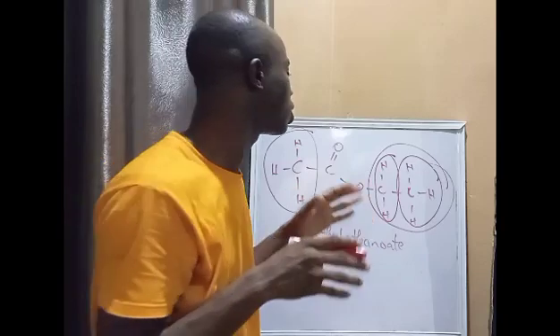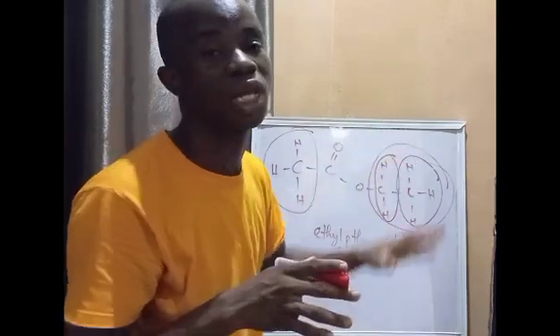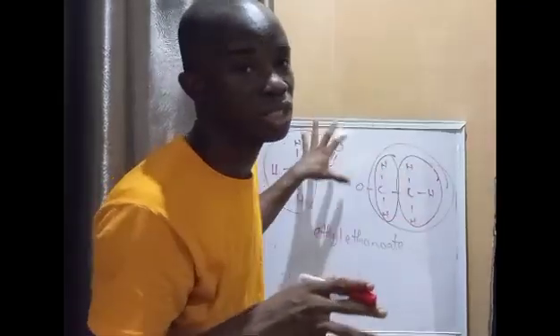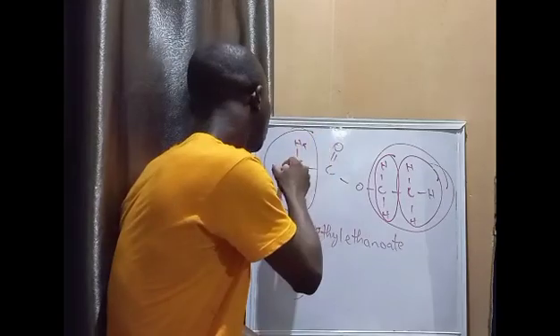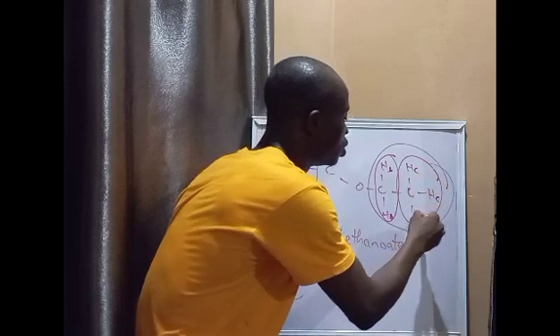So with what I've done now, I could conclude that in the NMR spectrum of this ethyl ethanoate, I'm going to have three different signals because there are three different kinds of hydrogens in this compound. Labeling them, I can say I have HA, HA, HA, HB, HB, HC, HC, HC.